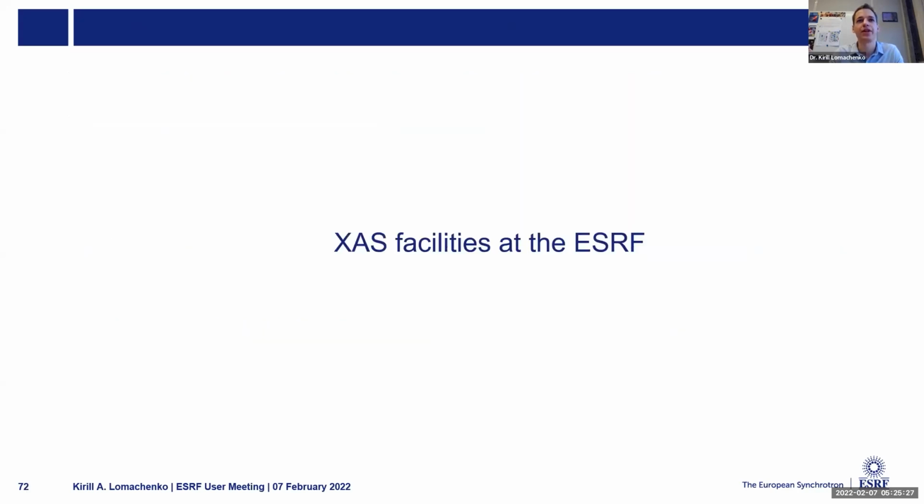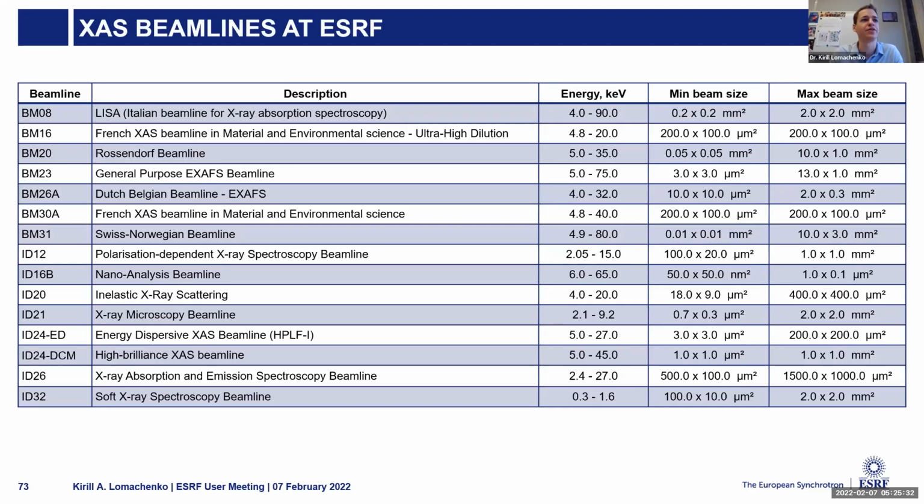So, the final part is a very short overview of XAS facilities at the ESRF. XAS is a very popular technique here. We have a lot of beamlines that do XAS with different flavors.